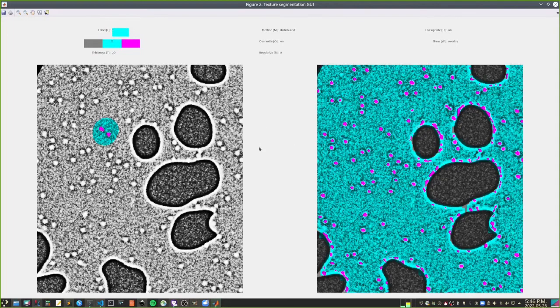Basically, we can take feedback from the result, like around this pore, because you see the cursor is on both images. So here they're not fibers. So I'm gonna put this blue, and you already see a big effect. And here also that's not a fiber.